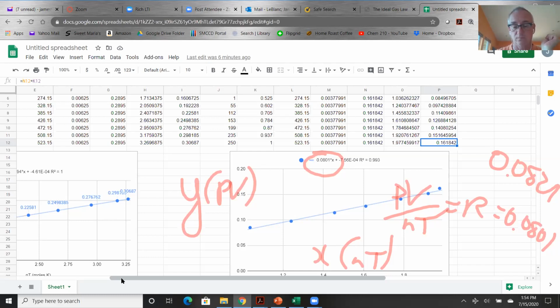In the discussion, what do I have to discuss? Do I have to compare these 3 gases? Well, have you read it? Just read it, and it'll tell you what you need. In any discussion, you basically discuss your results. Did you get close to the value of R? Why or why not? Do the 3 gases have different values of R? Why might that be? That sort of thing.